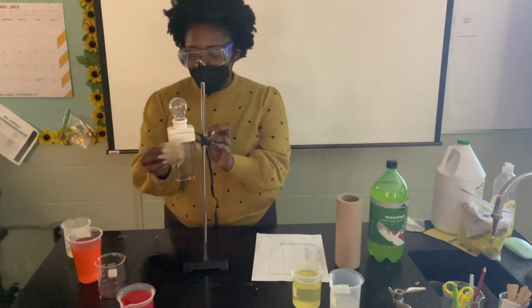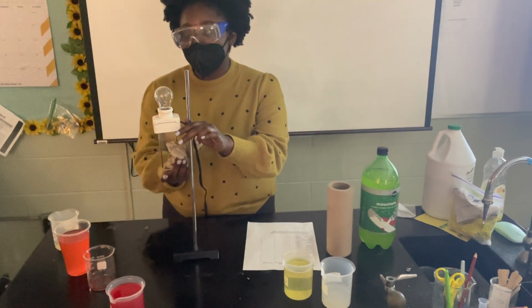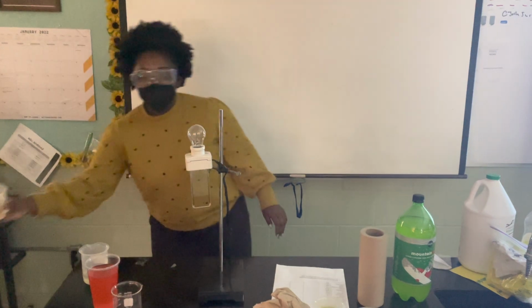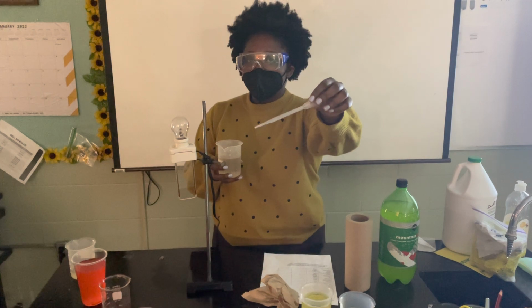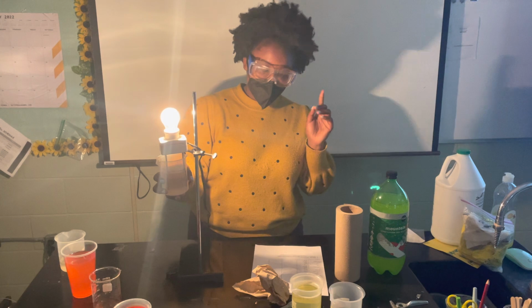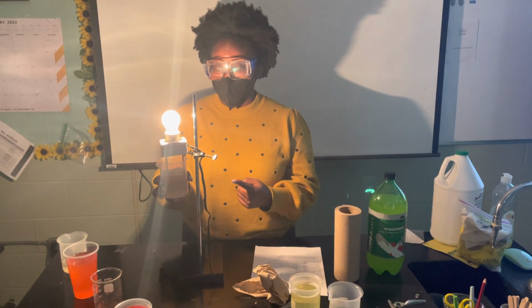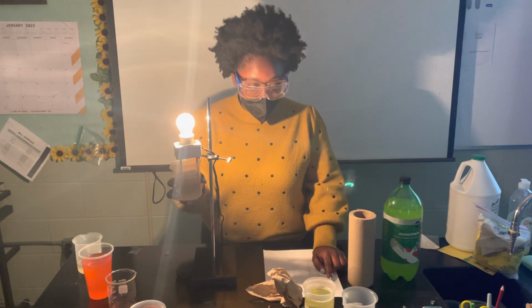Let's check out baking soda in water. Notice I'm cleaning off the probe to prevent cross-contamination. Stanley, that's a smart idea. Thank you. Here's baking soda in water. Do you know what this instrument is? It's called a pipette. Shoot. I am so glad that I used a school-appropriate word in that moment, because we would have had to start over. This is definitely a good conductor. Look how bright that light is. Wow, this is baking soda and water.